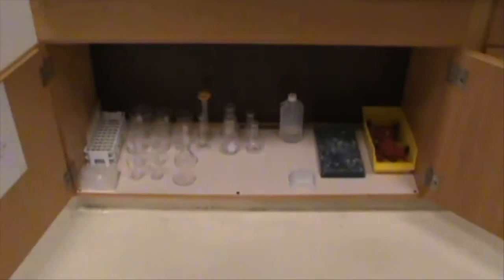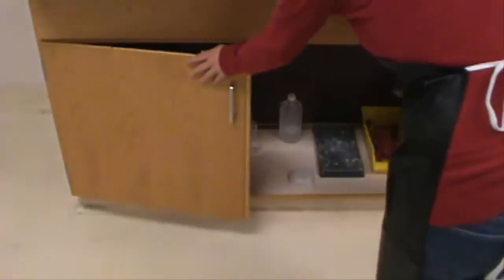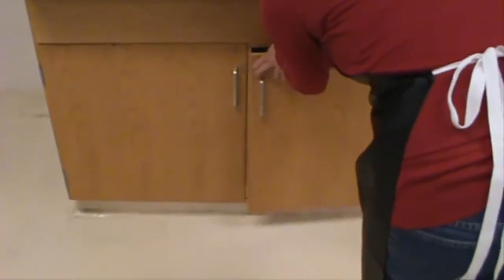Next is learning how to measure volume. Multiple pieces of glassware can measure volume, but today we are using a graduated cylinder. There are two graduated cylinders, a 10 milliliter and a 50 milliliter. In Part 1, we will be using the 50 milliliter. Make sure you close your cabinet properly as shown.